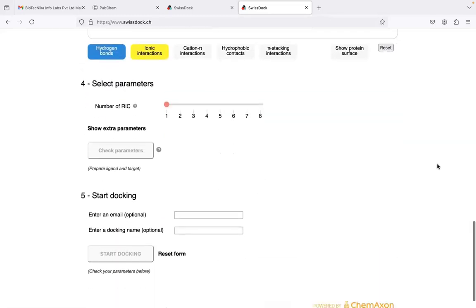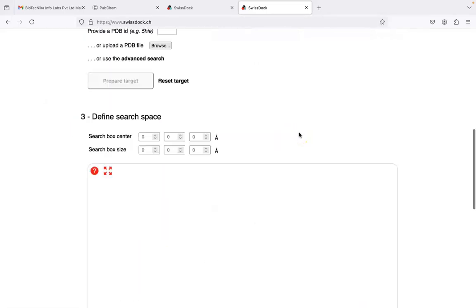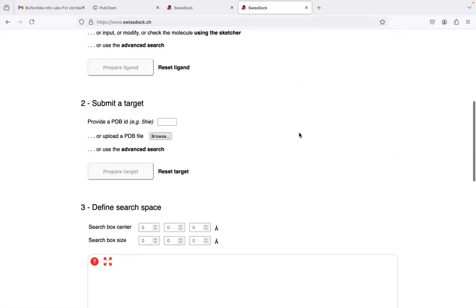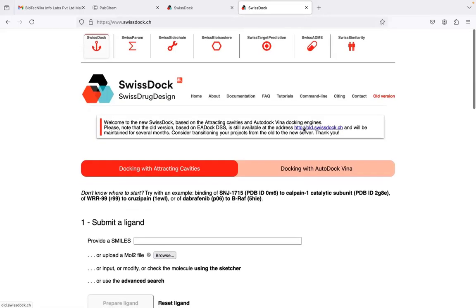After that you will be selecting the parameters and then we are good to go. This is an automated tool, but there is a restriction that we will check in the parameters part: for free you can access only for 1 hour. The whole process should only take 1 hour, then it will give you the result, in the free version.